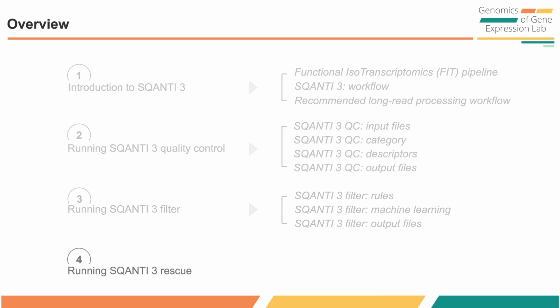Finally, we will demonstrate how to use the SQANTI3 Rescue feature, which aims to recover potentially valid transcripts discarded as artifacts due to a lack of confident validation during the quality control step.